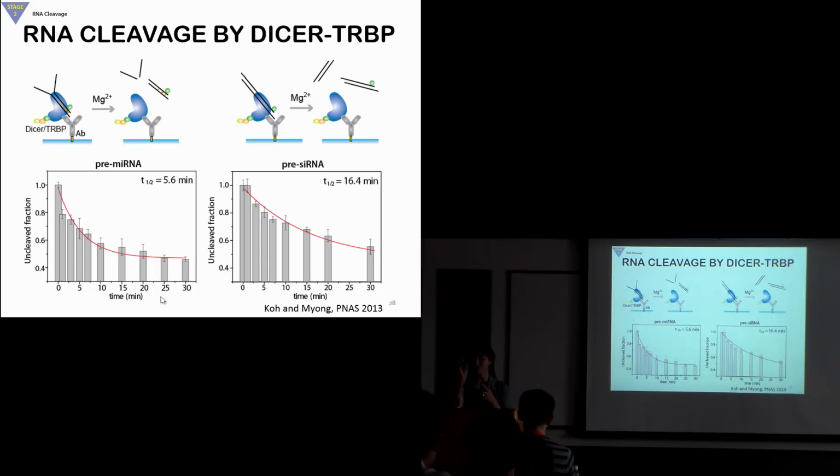Well, if they move, you mean the fluorophore and the protein moving together, then the intensity shouldn't change, right? It depends on the distance between the protein and the fluorophore in that case, right? Yeah, then we can't tell. That's why it can change binding position without changing the intensity, right? You're depicting that situation. That's true. So we don't really rely on one single assay for our assessment.